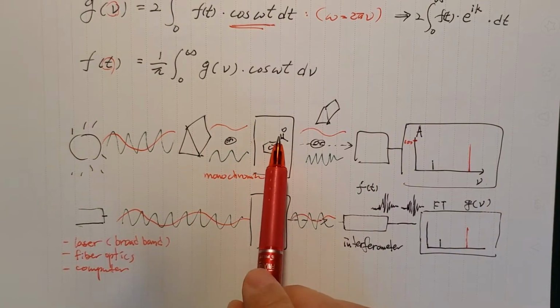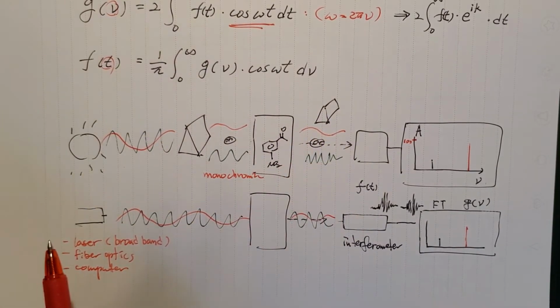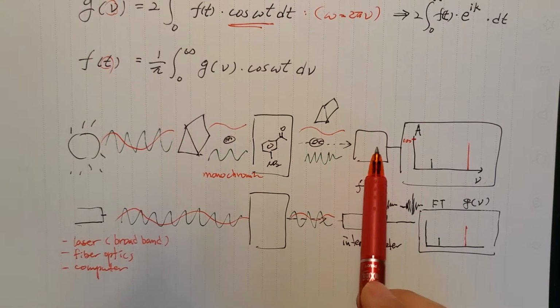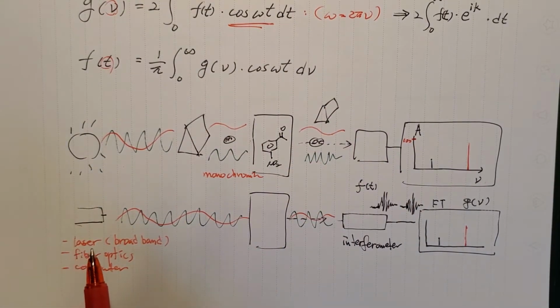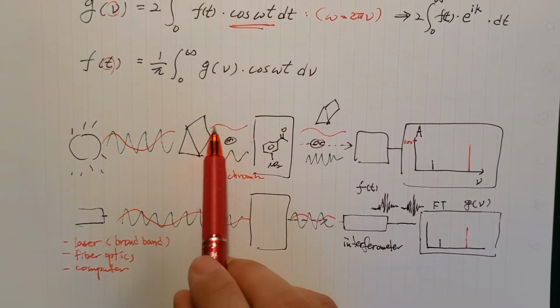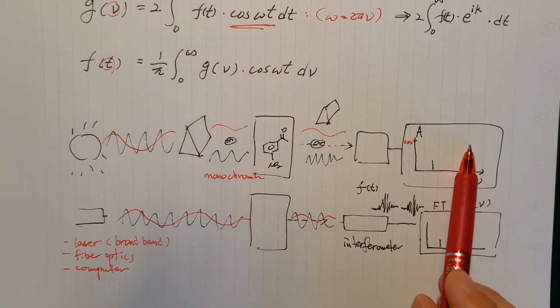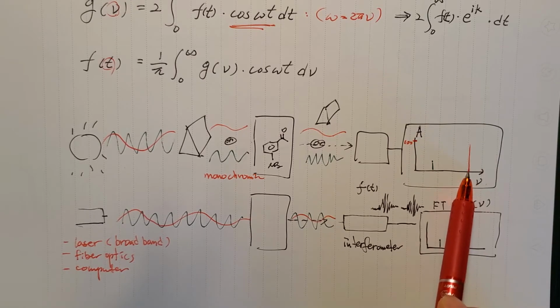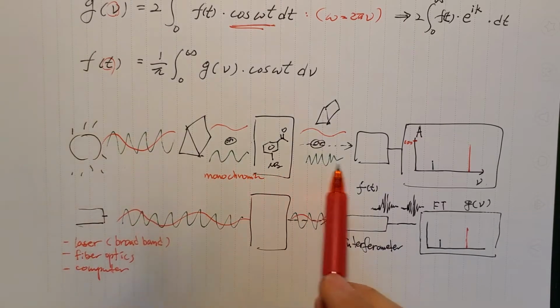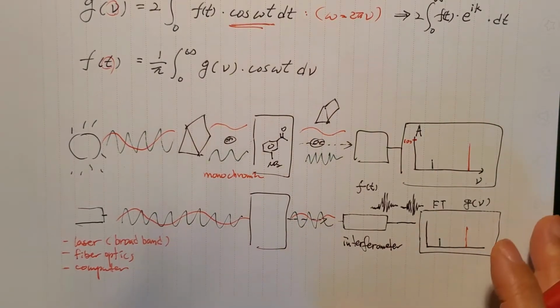So in each case you have some changes on each photon at a time, and then this will be detected by the detector. Because we know the frequency, we just plot out the intensity, and same for the shorter wavelength light with a higher energy.